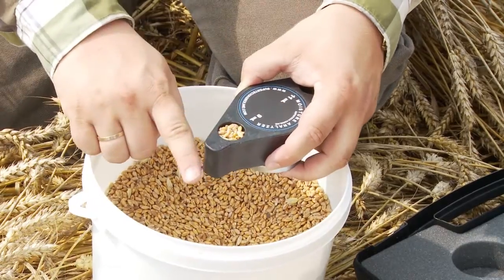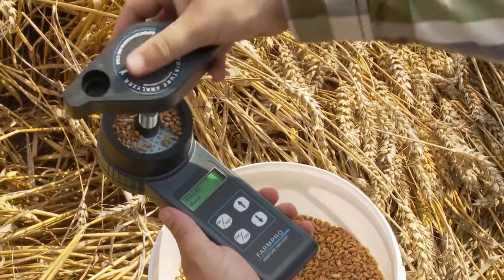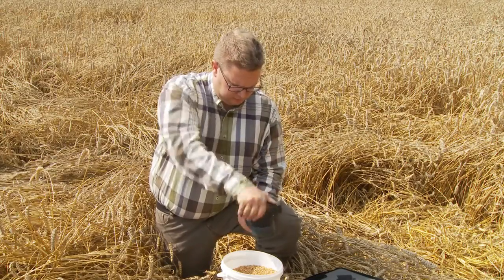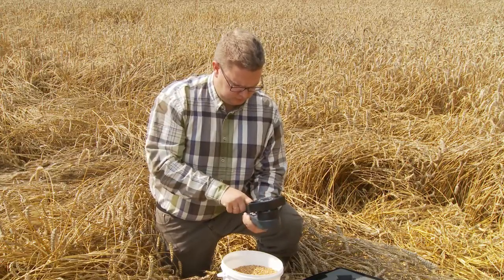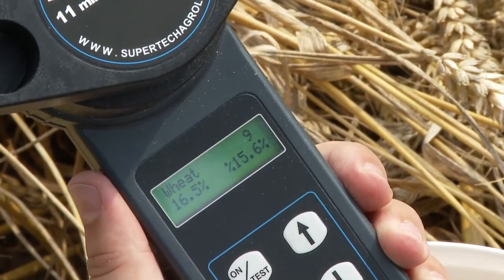The built-in measuring cup in the grinder handle makes it quick and easy to measure out the volume for testing. Pour the sample into the grinder and turn the handle to grind and compress the crop sample. Press the test button and you can read the moisture content directly from the display.